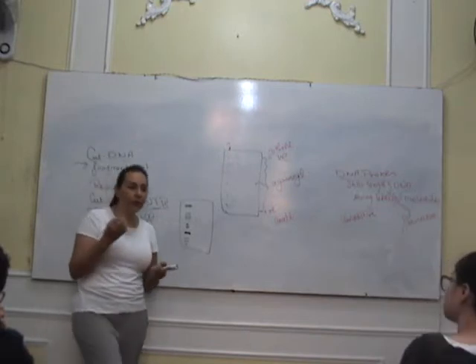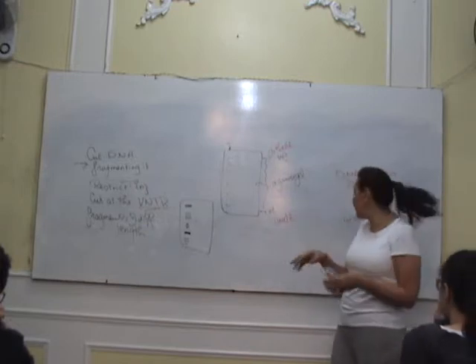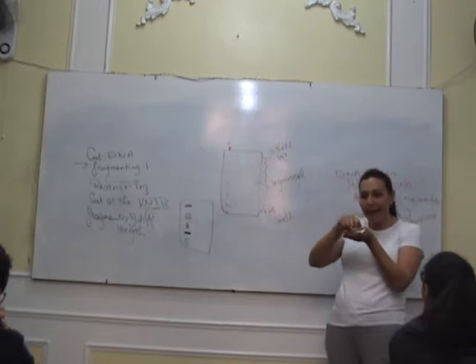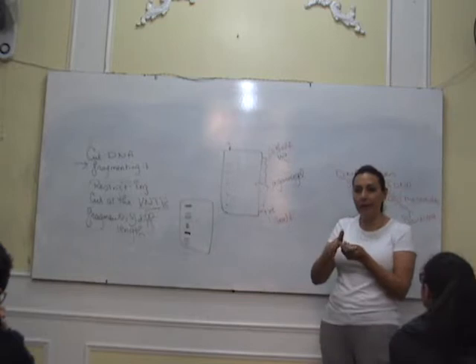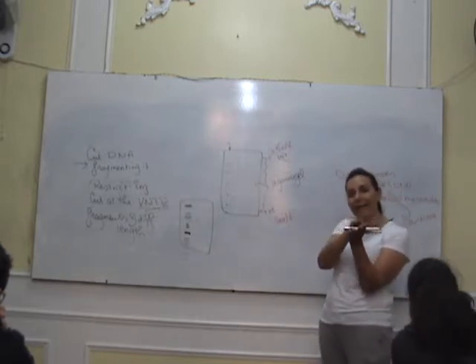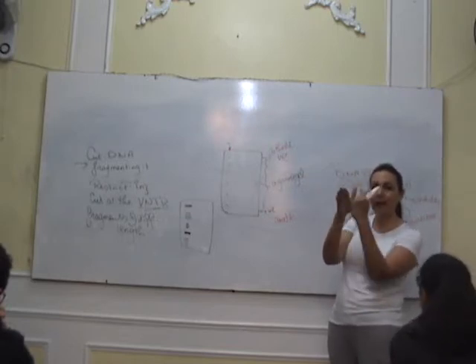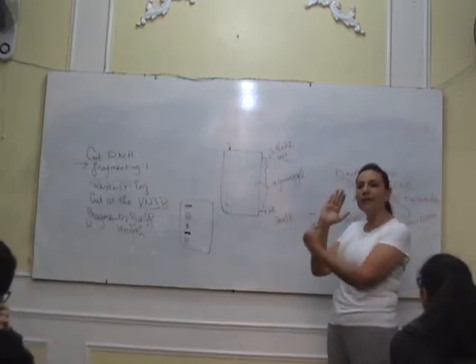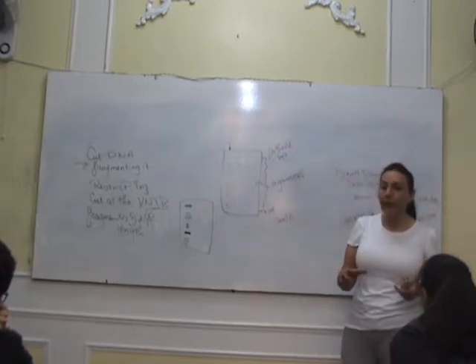Now, the nucleotides used were labeled with something radioactive. The radioactivity prints black on an X-ray film. So if you put an X-ray film on top of your paper with the DNA probes bound to the DNA, it is going to print black lines on the X-ray film. These black lines are your DNA fragments. That's the DNA fingerprint, that's the pattern shown.